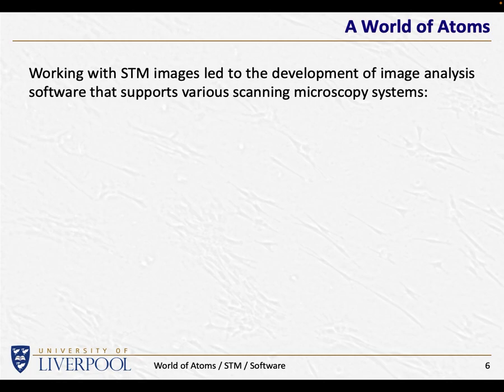And when I was working with this so-called scanning tunneling microscope, hereafter just referred to as STM, when working with these STM images, I realized that my students needed to be able to analyze and process these images. And the images that were produced by these microscopes, there wasn't any software around that would readily allow my students to look at the images, load the images, process the images to make details more clear, and perhaps analyze the images to work out, for instance, how far apart are the atoms on average. That's the sort of thing that we might be interested to know.